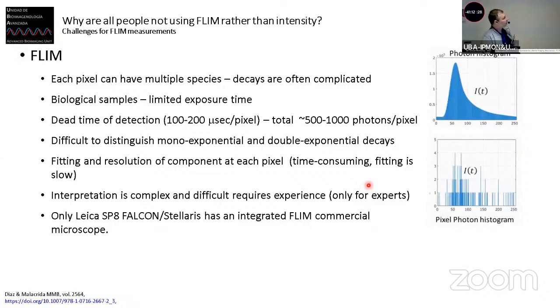Okay, so the last thing that I want to mention about why not everyone is doing fluorescence lifetime imaging is because there are not that many commercial microscopes that you can buy, with a key in the hand, and you push the button, and you get the decay. So far now we have the Leica SP8 with the Falcon Stellaris model, which is a commercial microscope that you can order, and they will set it up in your lab, and you will have lifetime without basically any trouble.